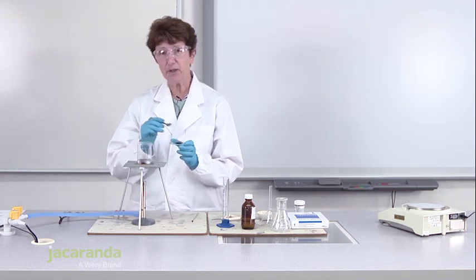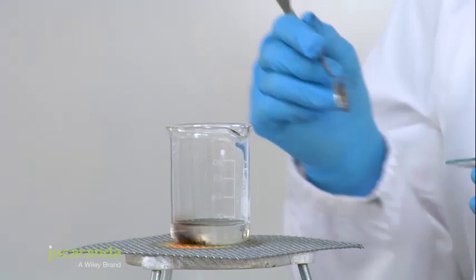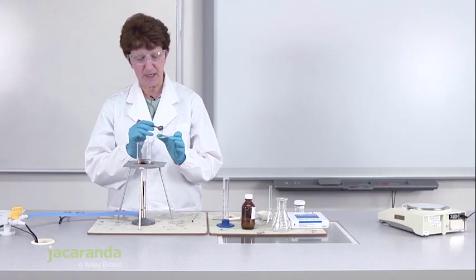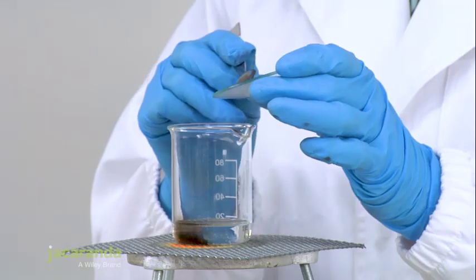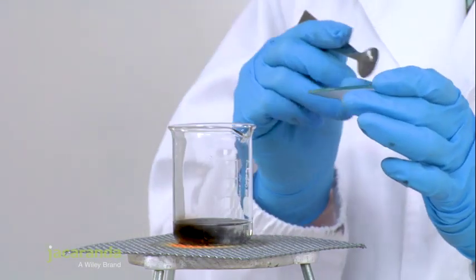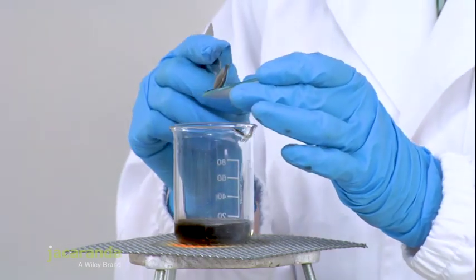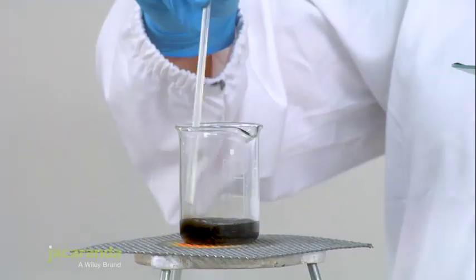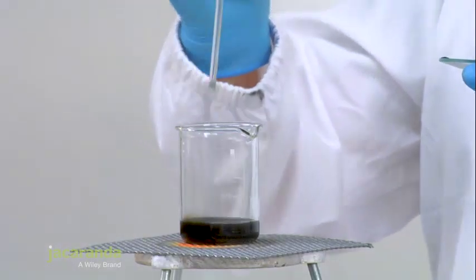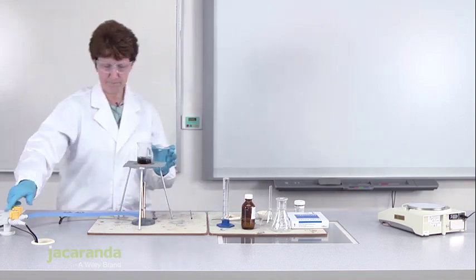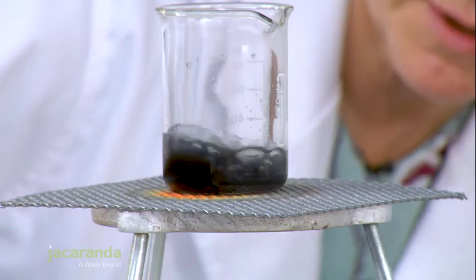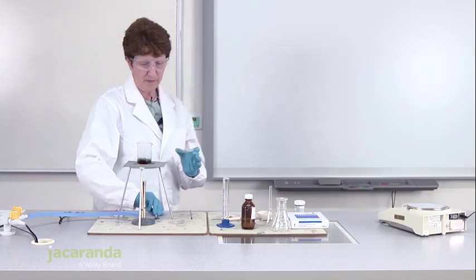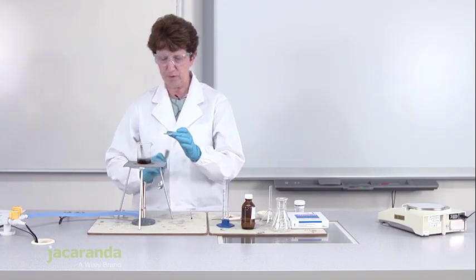You only need to add a little bit at a time and then stir it to make sure it all fully mixes and all fully reacts. I'm going to start adding a little bit at a time and stir it up. That's a bit too fast, so I'm going to lower the flame and continue to add my copper oxide.